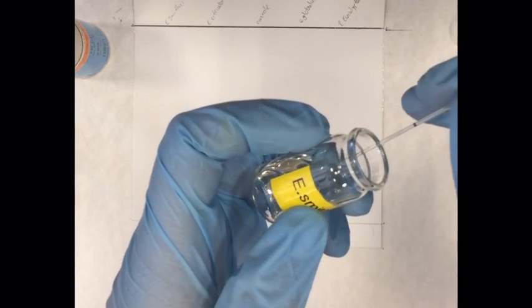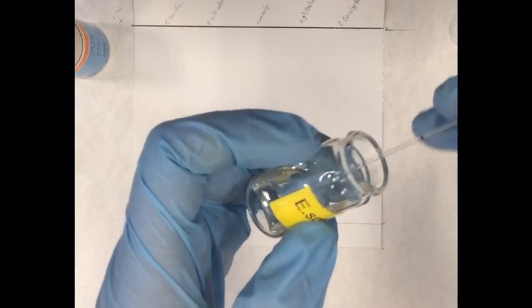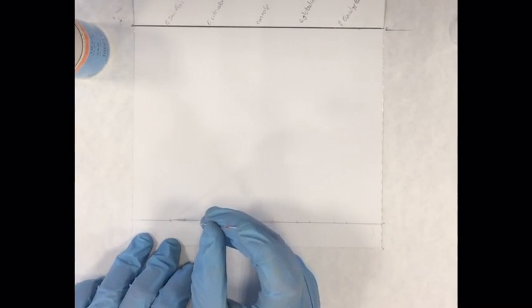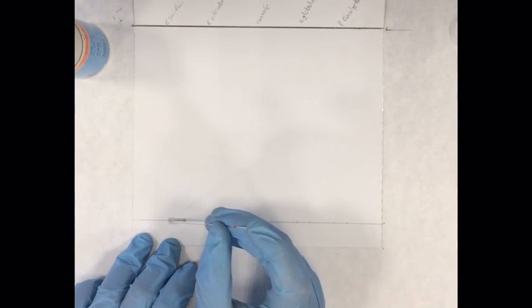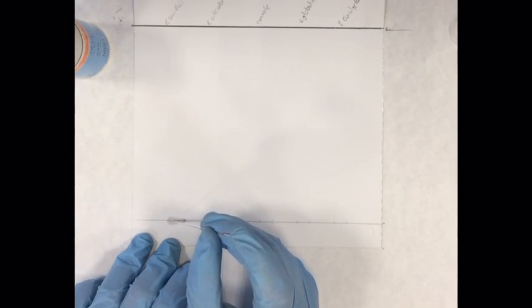Using a spotter, place the spotter inside your sample and make sure the liquid goes all the way up the tube until the mark. Spot a band on your TLC plate. Carefully slide the spotter across the desired distance, making sure all the liquid exits the tube.